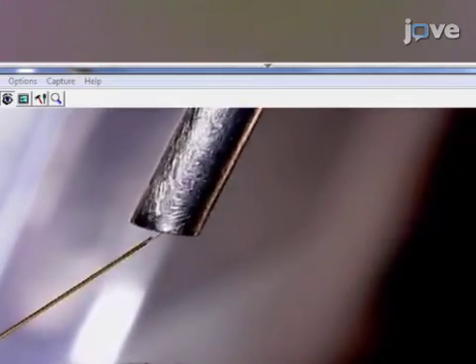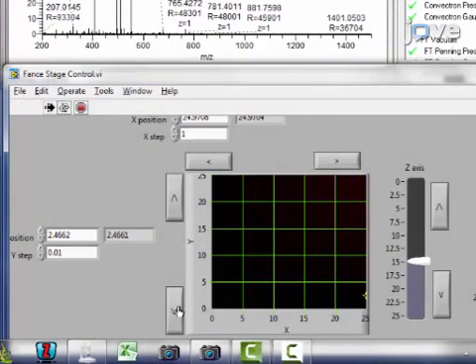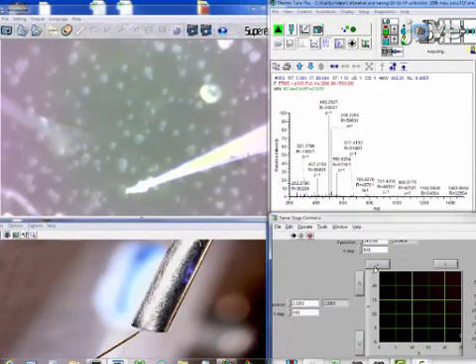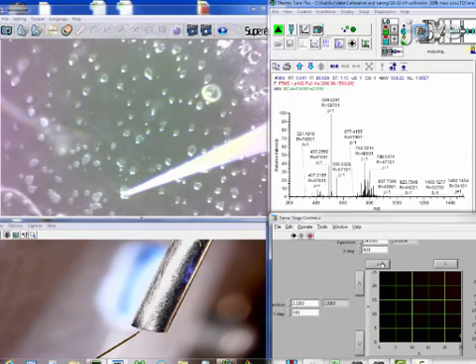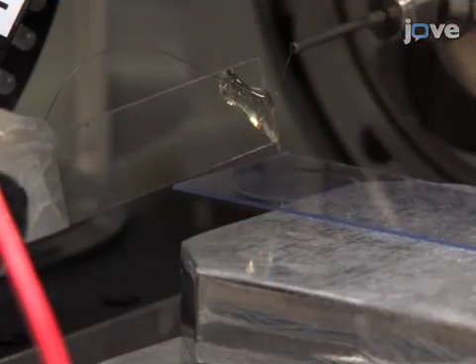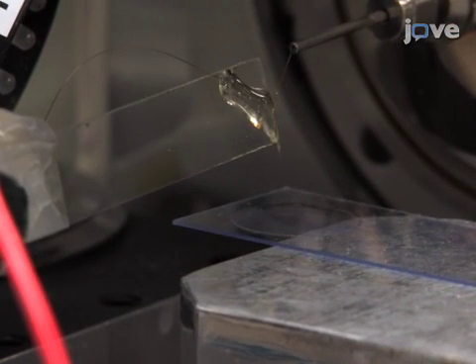Use the USB digital microscope on the side of the single probe to monitor the working conditions of the nano-ESI emitter. Use the motorized XYZ stage control program and digital stereo microscope to locate a cell of interest and precisely position the single probe tip above the sample. Start MS data acquisition before the single probe tip is inserted into the cell. Lower down the cell-containing plate to pull the single probe tip out of the cell. Finally, let the solvent flow for approximately 3 minutes to completely flush the single probe.